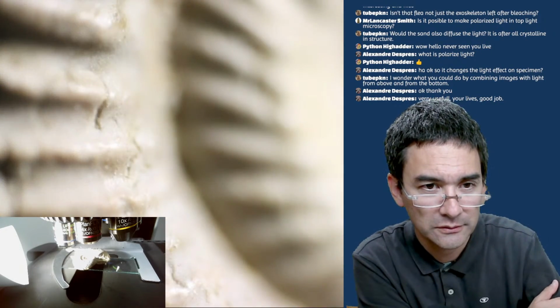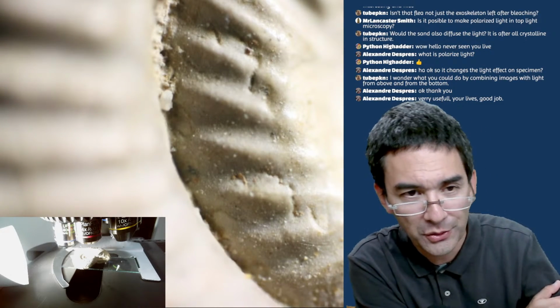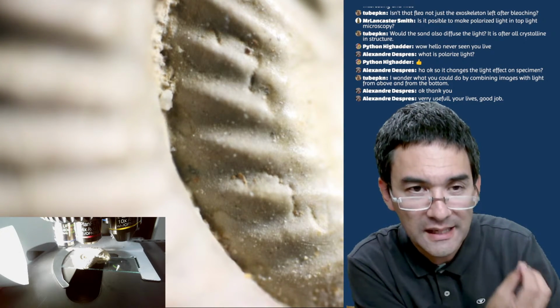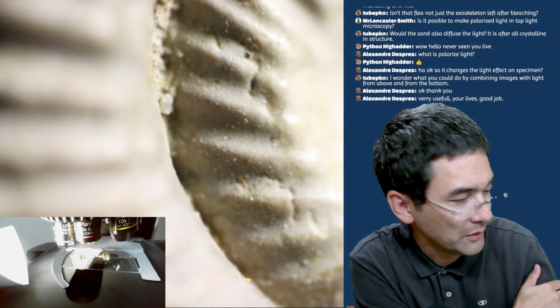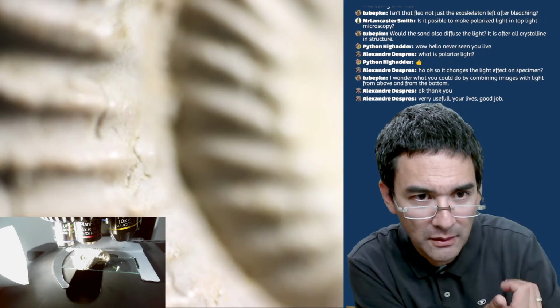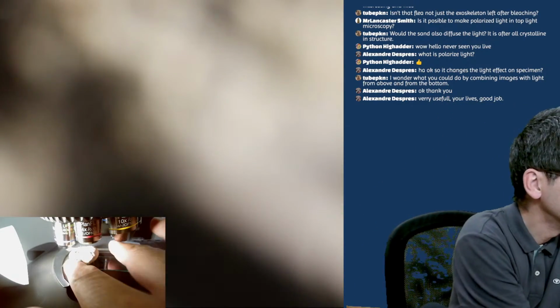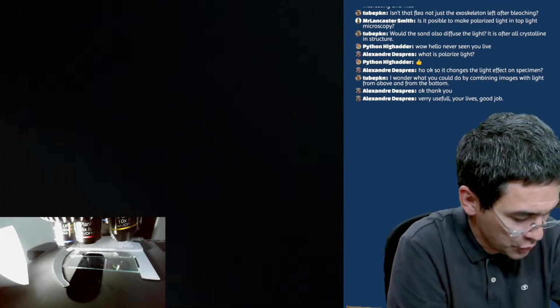You see also over here, this one is not in focus, and another part is not in focus. And the light coming from the side actually increases the sense of depth because of the shadows. Yeah, that's actually a good thing, because you actually feel like there's depth there, and you can estimate a little bit better if things go up or down. So that was the ammonite. But again, one always has to be careful when doing these things so that you don't damage the objectives.